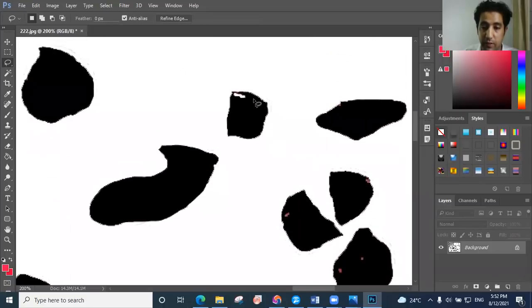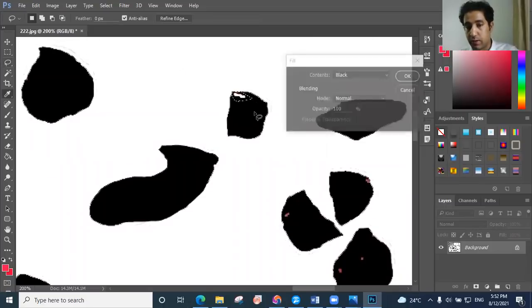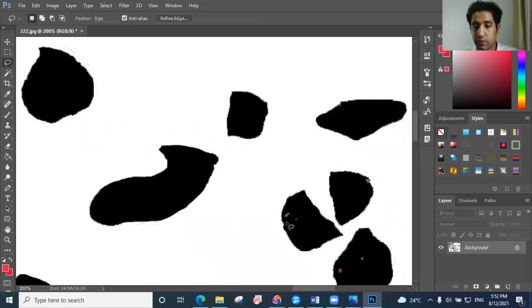Right, this side is clear, and we just move on.